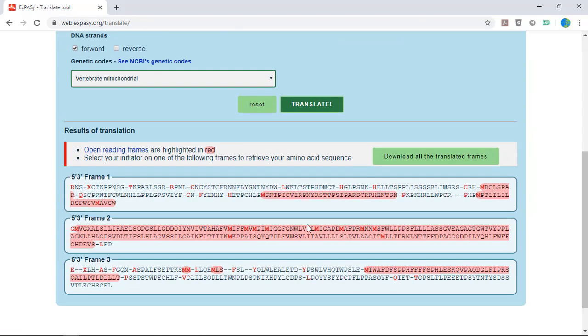You should end up with three translations corresponding to all three potential reading frames. You should be immediately able to see which frame is the correct one because it will have the longest continuous reading frame highlighted in red.